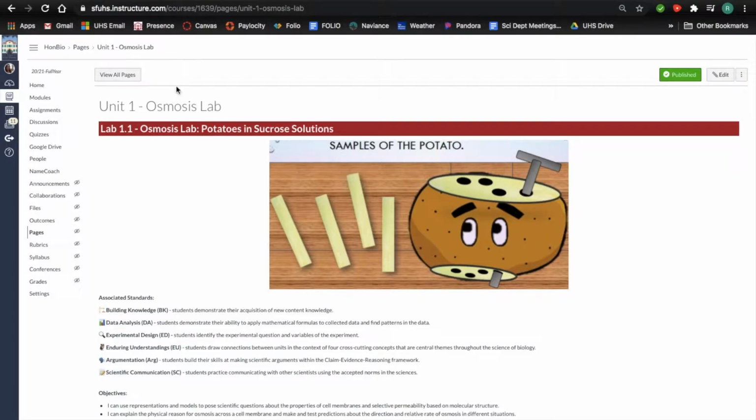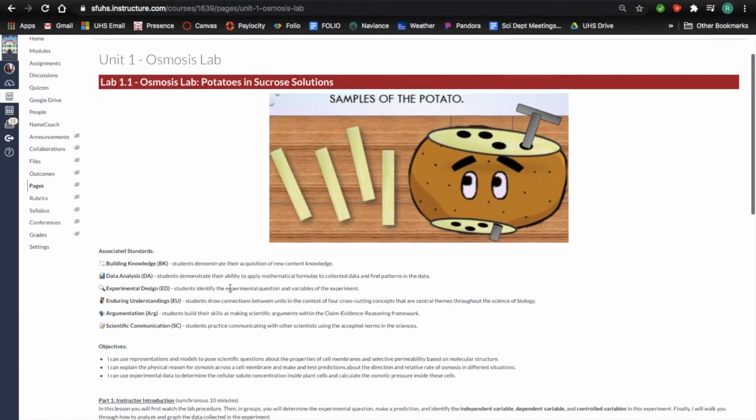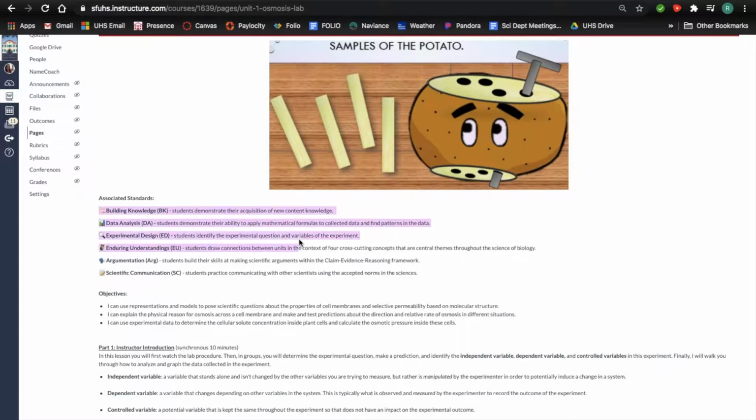Hi guys, so this is a video to show you the Osmosis Lab potatoes in sucrose solutions data analysis piece. So we have to go over the data analysis, and in this case students are going to be able to use mathematical formulas in data analysis.